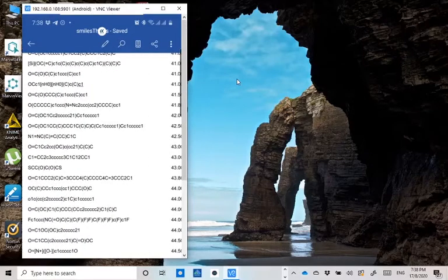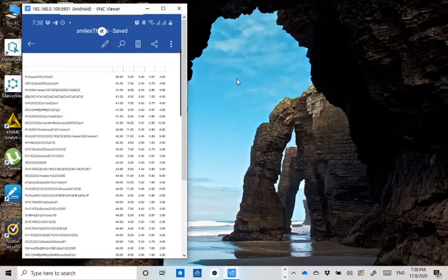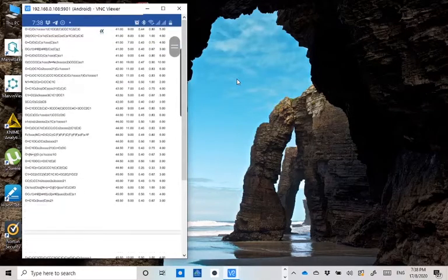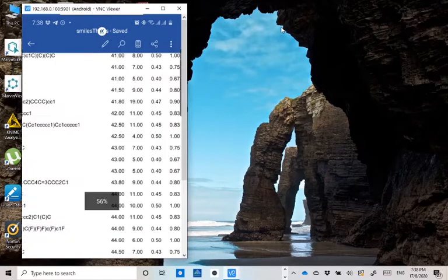I'm sure you have seen a lot of data, maybe from a thesis, where in the appendix you get something like this. What you see here is a set of strings to your left and some numbers to your right. Now these strings, let me increase it.